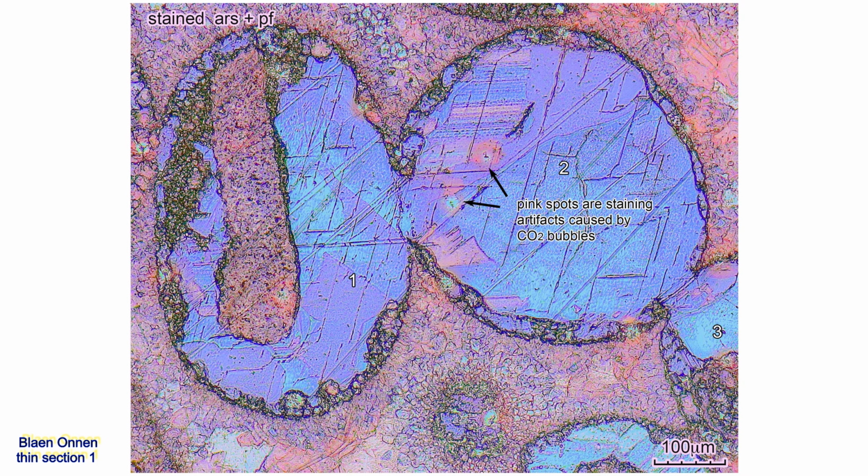Most of the intergranular cement has a blotchy pink and blue stain, but the early cement on the lower left with the blotchy stain is separated by its euhedral surfaces from a later unstained cement at the center of the intergranular pore.